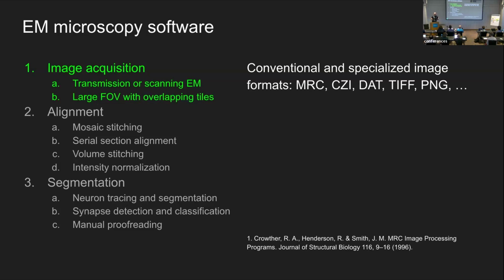Microscopy vendors do things that are appropriate and easy to handle for particular imaging pipelines. So if you have a scanning microscope, for example, you want to have a file format that allows you to stream out that scanned data very easily. Sometimes microscopy vendors convert this into file formats that are a little bit more user-friendly, like this MRC format from the MRC LMB.